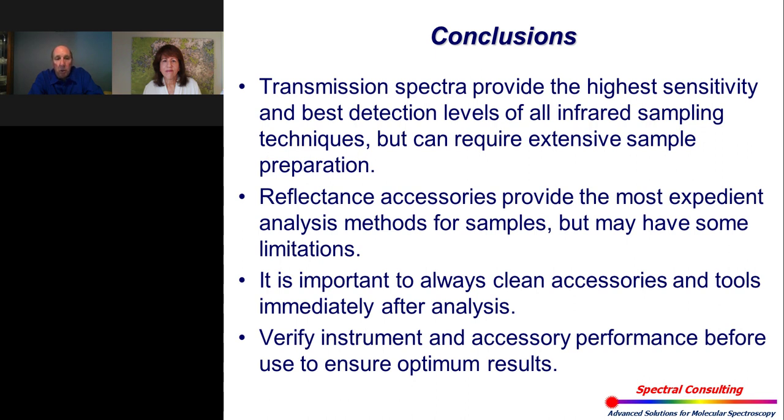That way, when you use the instrument, it's working to your satisfaction and you've got the data and the information. So if somebody ever questions the results that you've obtained, you say, look, I verified in the morning or in that day that the data I'm going to get from this accessory or this instrument is going to perform like it did the last time I used it, because I'm looking at the values in my notebook and I'm getting the same information time after time. That's your reassurance that you're getting complete, quality, optimum data every time you use the instrument.